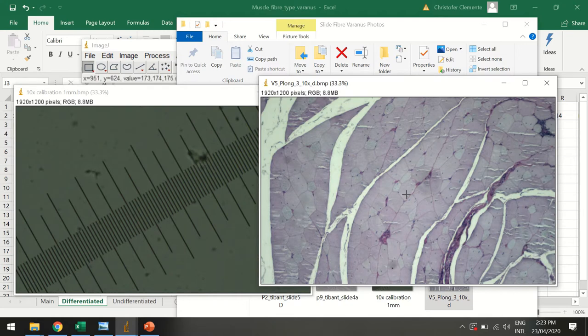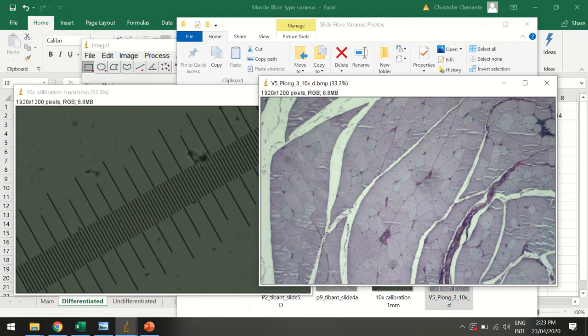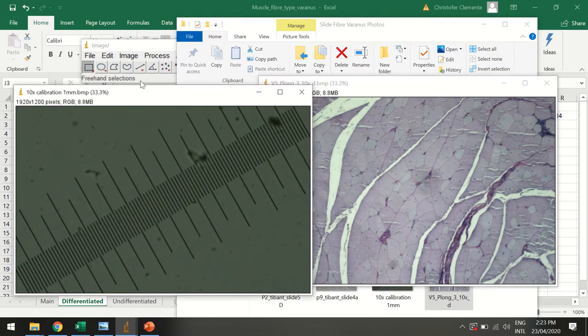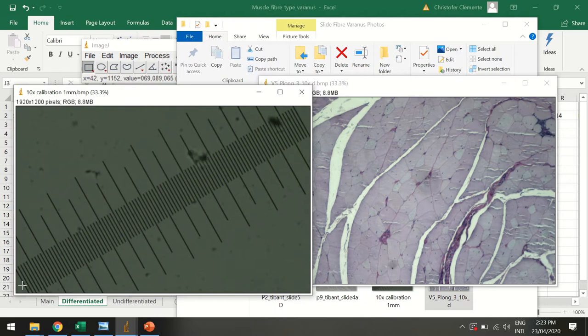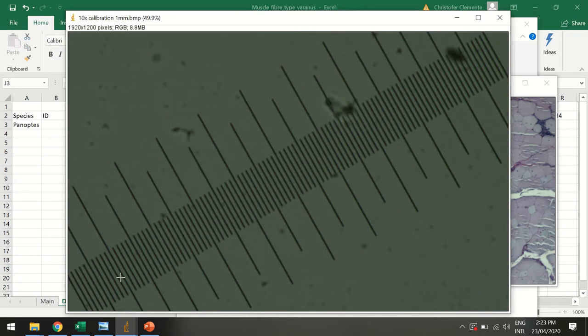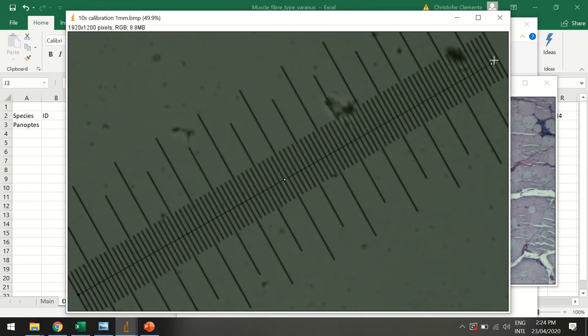Now remember, with this calibration you'll only have to do it once until you close ImageJ. Then you'll have to do it every time you open up ImageJ. To set some calibration, we use this little grid. This grid is exactly one millimeter long. You can see it sort of starts in this bottom left corner, ends in this top right. So I'm going to get this line tool and I'm going to draw a line. I might make it a bit bigger so it's a bit more accurate.